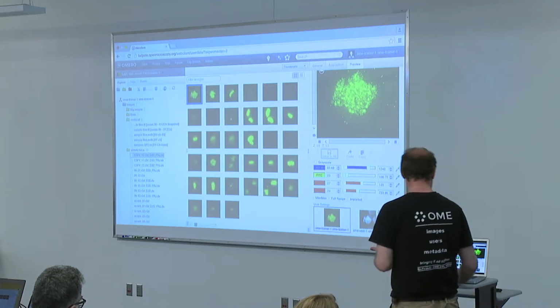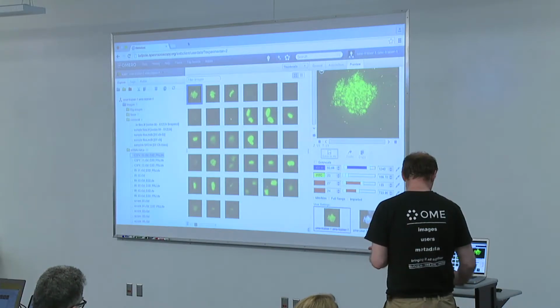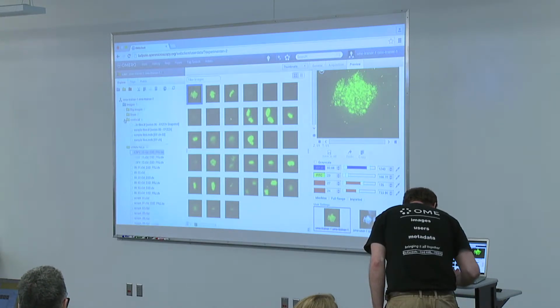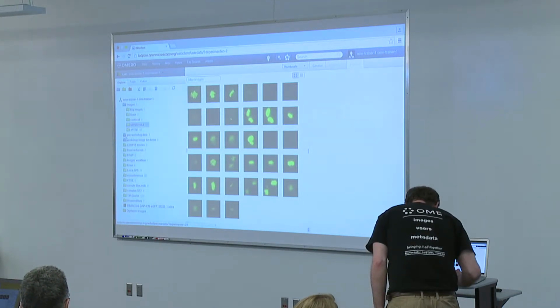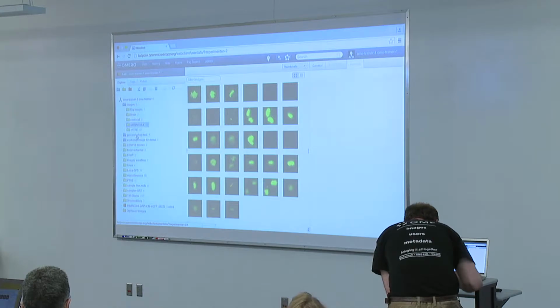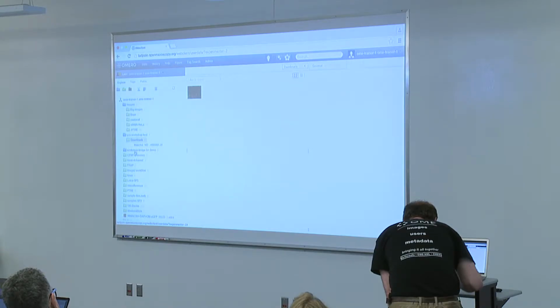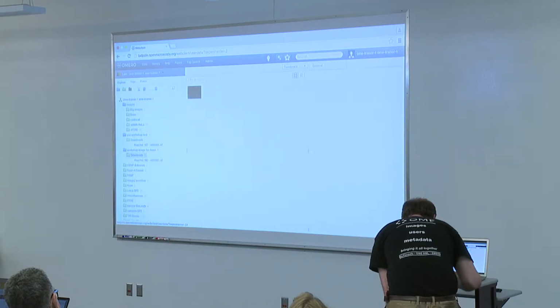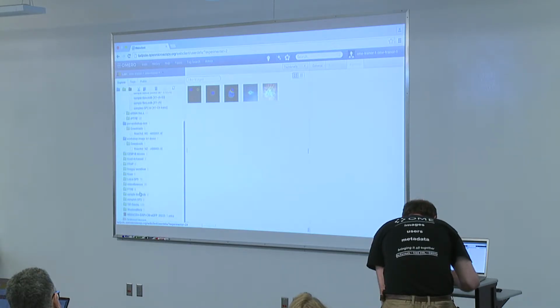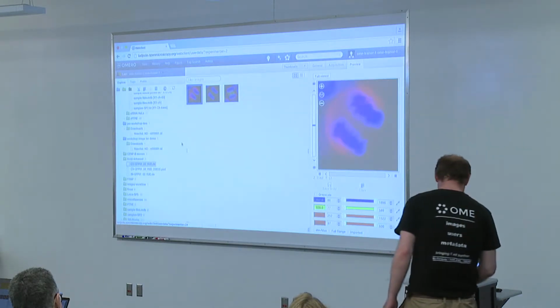And once more to the publication, because when we are in web, we have a new application called OMERO Figure. So if you would like to play with that, then go, and whoever you are, you will have at least 2 images which look quite nice. Let me just find them. Okay, let's work with these ones.